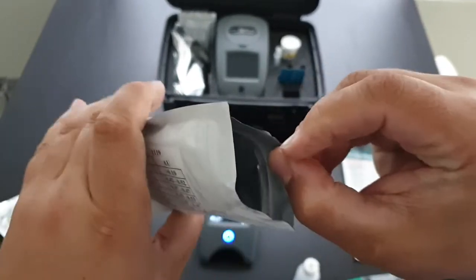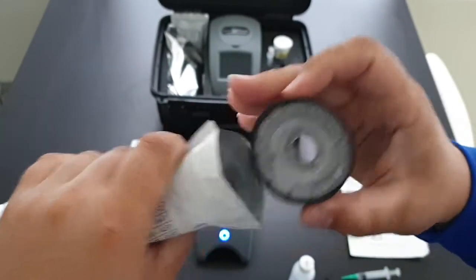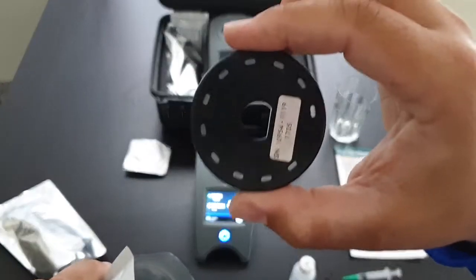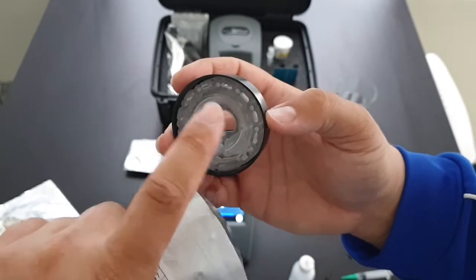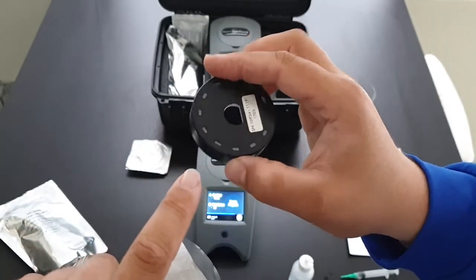They also come with a meter check disc which checks the calibration of the spin disc. This is also used to calibrate. And that's all that is. You want to make sure you don't touch the inside of the disc.